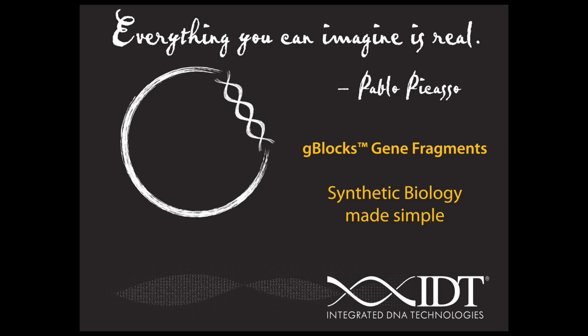When we're talking about the cost of these things, especially something like a 2 kilobase gene, it's very dependent on the complexity within the sequence. And I would hesitate to just throw out a number for that. If you look on our website, our base cost for synthesizing a 2 kilobase fragment is about 45 cents per base pair. Now, we do have some flexibility in that price, and we do adjust it accordingly based on the complexity of the sequence.